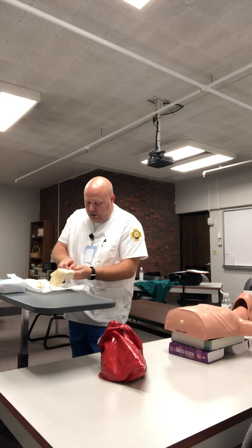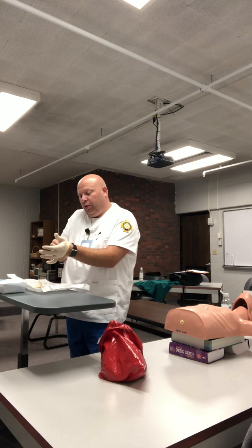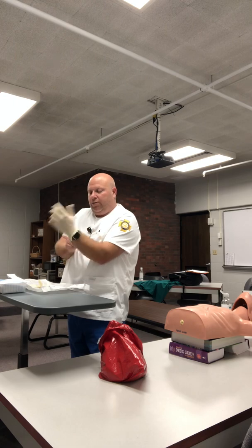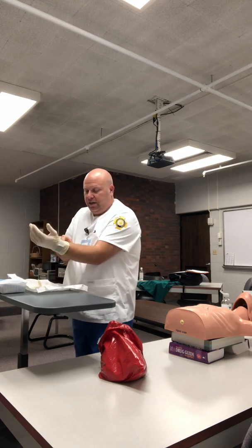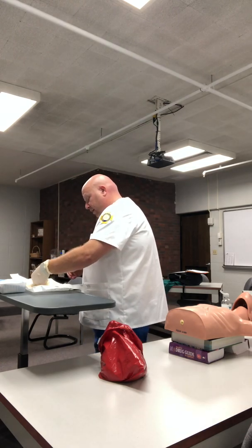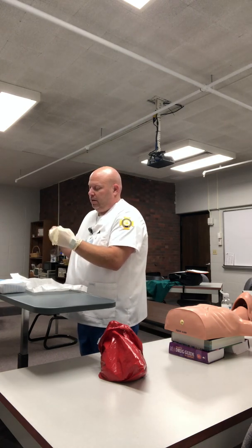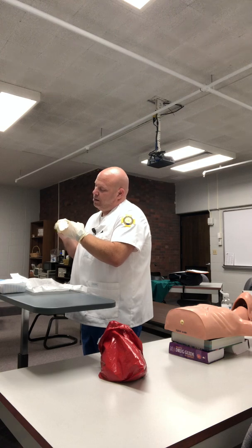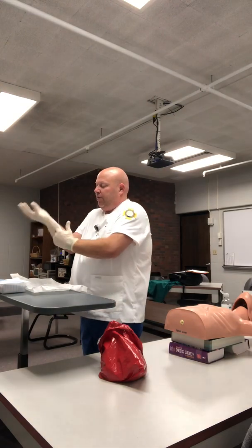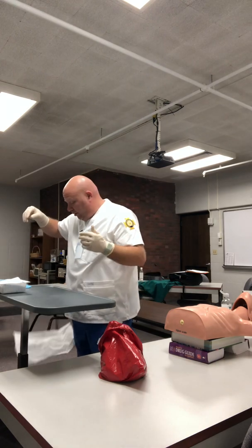I'm just going to make sure that when I'm pulling this up, I do not go on the inside of this cuff. I want to make sure that it's up over everything, just like that. With the other hand, I'm going to reach inside of the cuff of my right hand, putting my hand inside. My thumb out of the way, pulling that straight up. I'm going to pinch this in the middle and toss it in the trash.